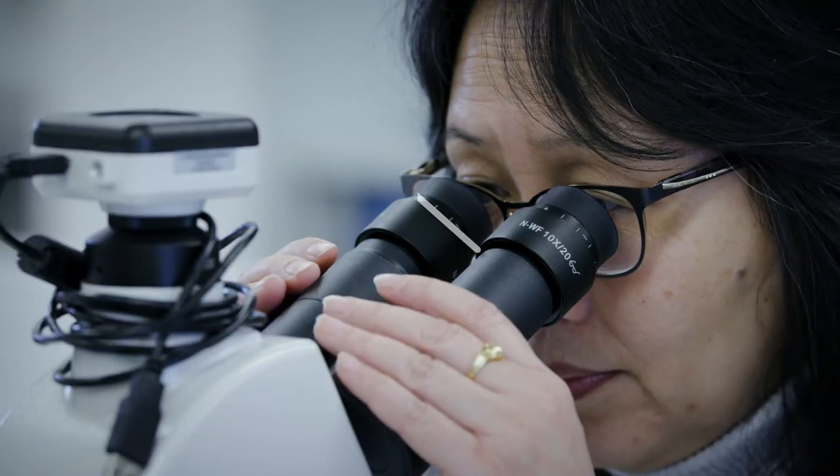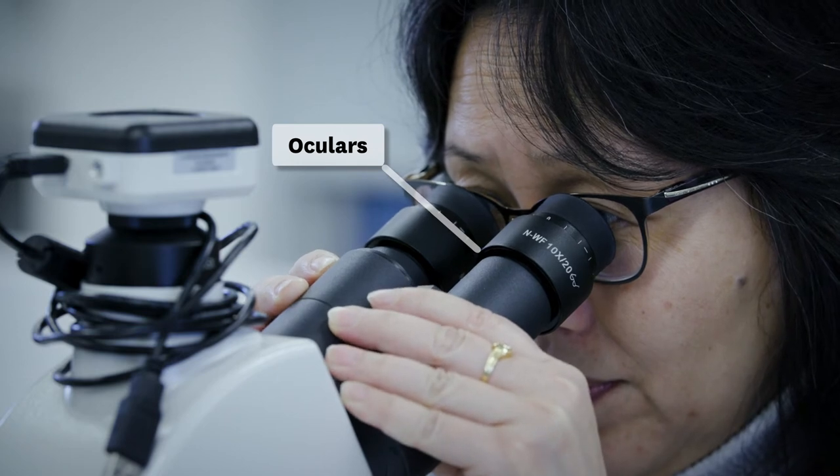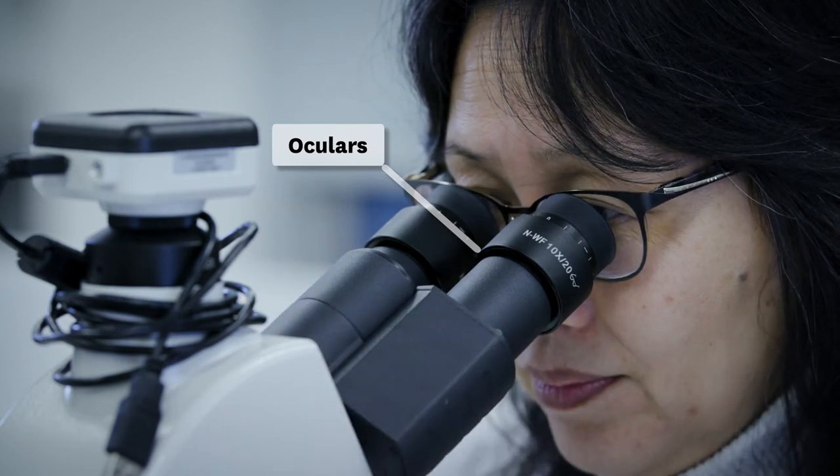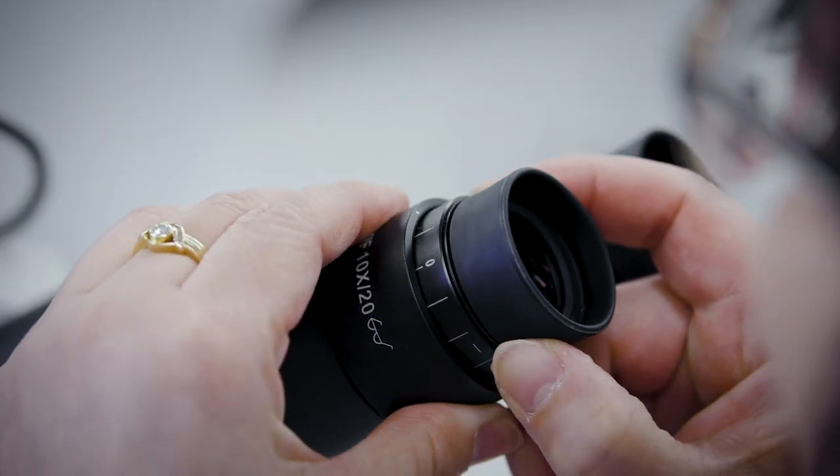Looking into the eyepiece, adjust the width of the oculars to suit the width of your eyes. It is important that you see the image with both of your eyes. Make sure the ring on the left ocular is set at zero.